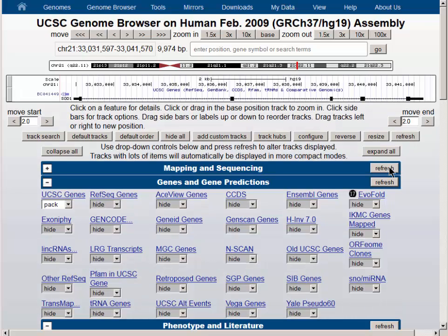The refresh button will turn on the UCSC Genes Track at the default location. This is the SOD1 gene, and it is easy to see that there are five exons in this gene.